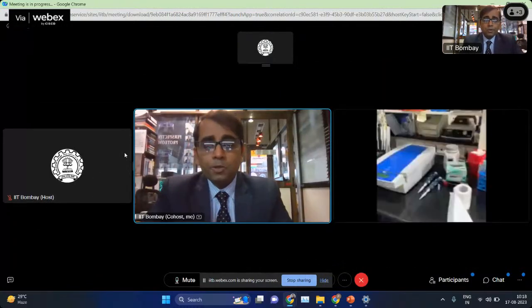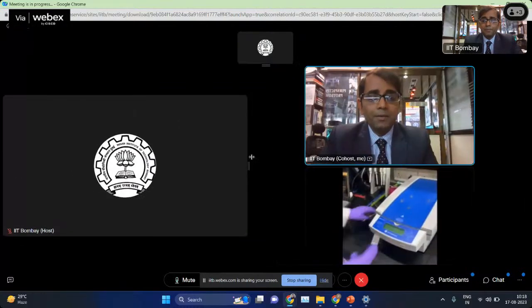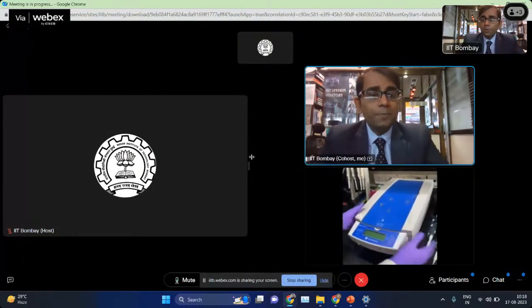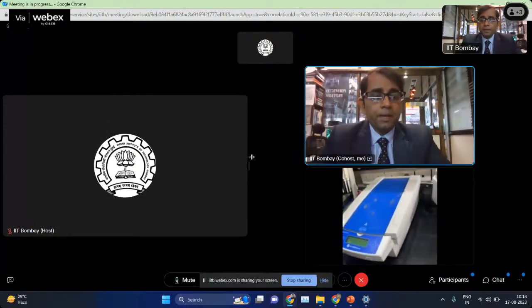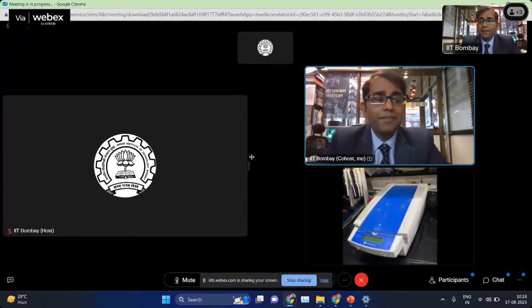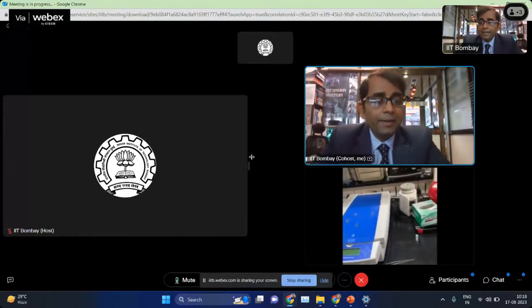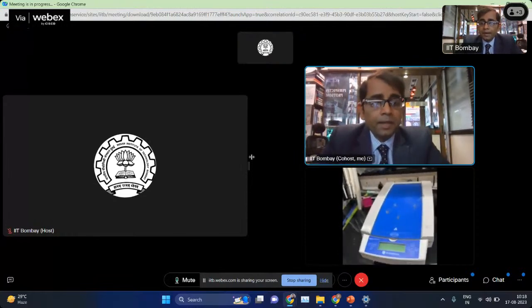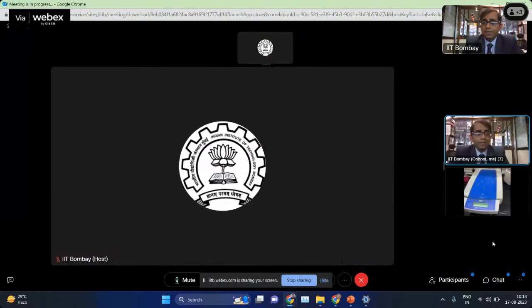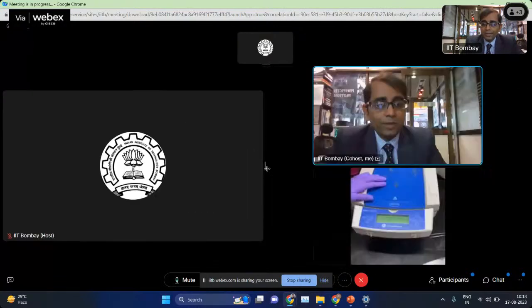So, as you have been studying in the theoretical part of the course, for separating the complex proteome with gel-based proteomics, first you need to rehydrate your protein on the IPG strips, right? Immobilized pH-gradient strips. And what you see in the main frame in the lab is essentially one of the units for doing the isoelectric focusing.